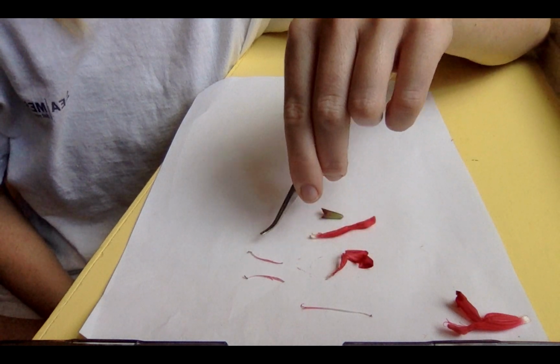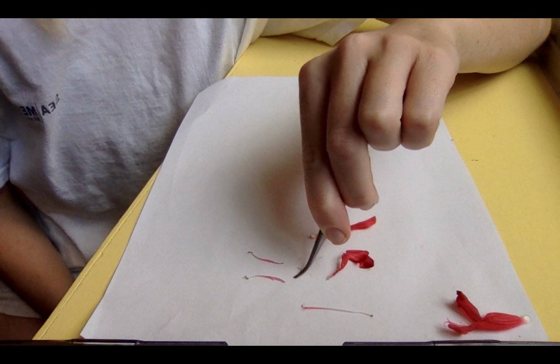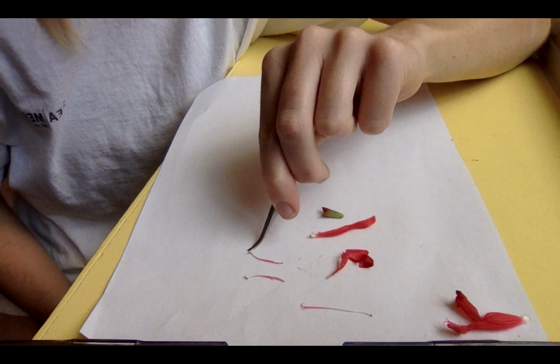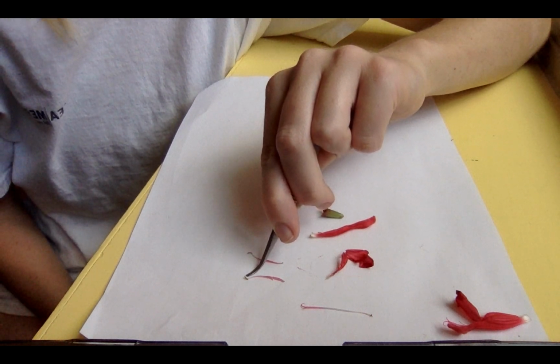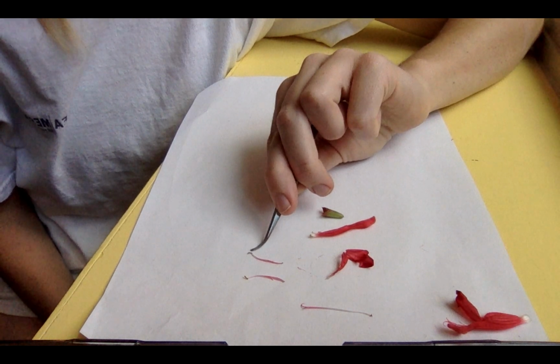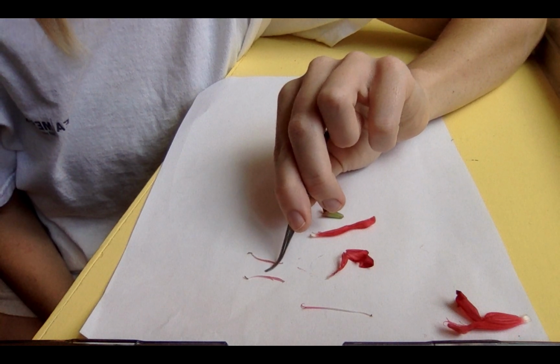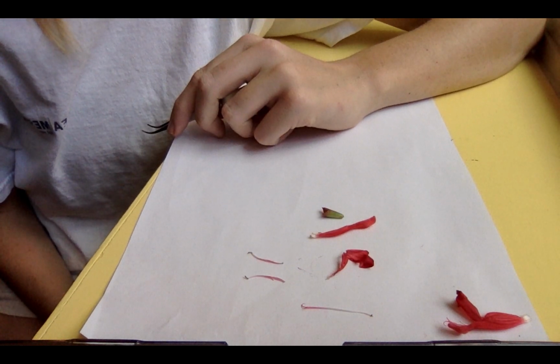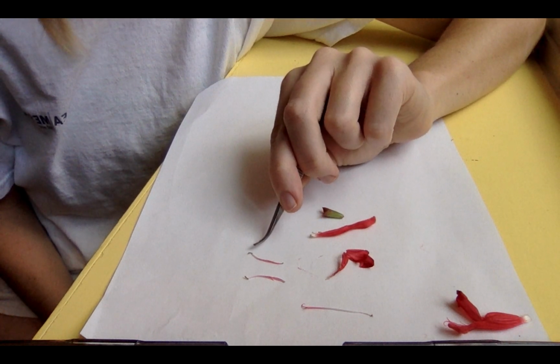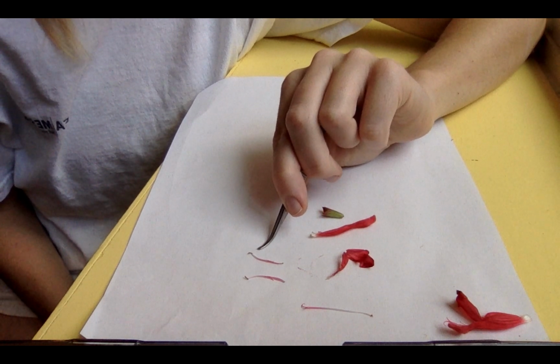We have the stamen, which is the male reproductive system, and that is the anther, which is the tip. It almost looks like a grain of rice. And that is what produces the pollen, which are the male gametes. And then the stalk-like structure is the filament. The filament is responsible for pushing the anther up closer to the top of the flower so it can more easily self-pollinate as well as cross-pollinate.